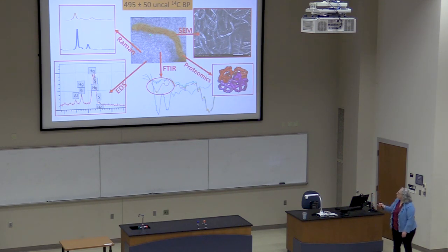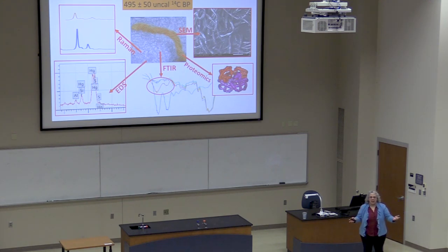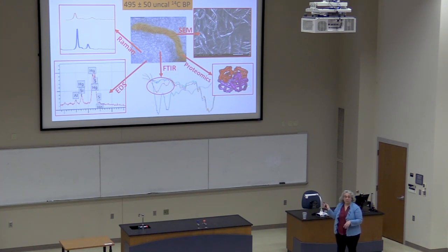Well, when we ran this by FTIR, we knew it was a cotton fiber, but we saw some protein signal. Oh, if this is paint, it must be stuck there with something proteinaceous, probably egg white, right? Like everybody uses egg to make paint. So I sent it off to a friend who does proteomics, which is studying the proteins that are here. And we only have one sample, so it's still kind of tentative. But it looks like blood. There was hemoglobin there. So now we're like, more samples, more samples, more samples.